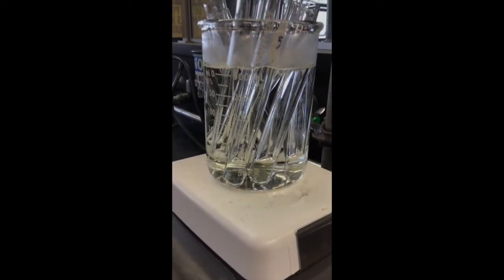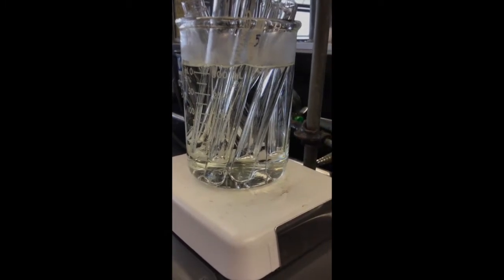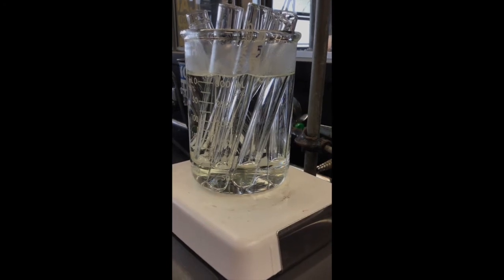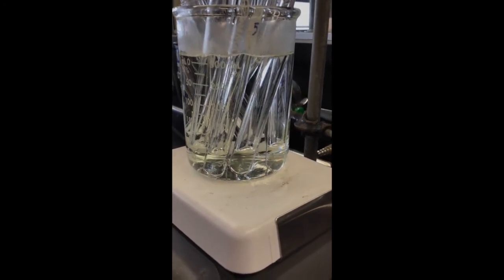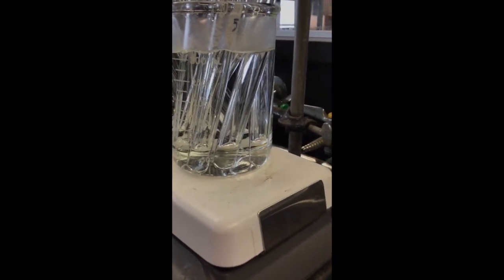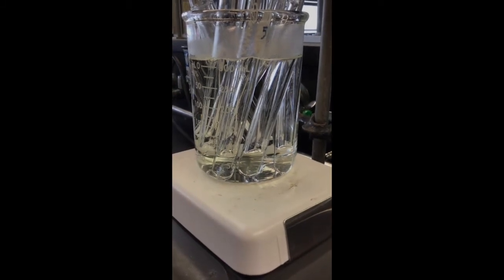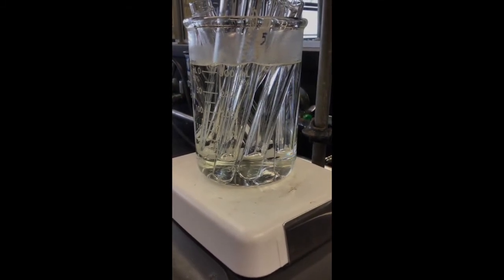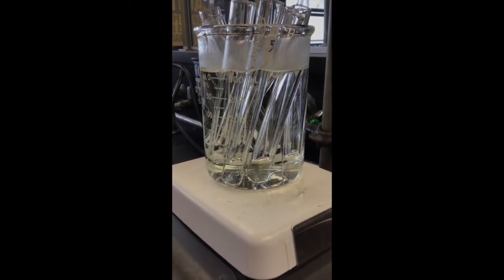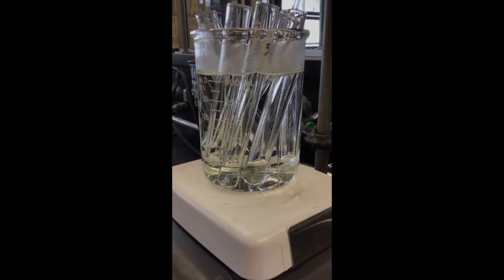Ideally we wouldn't have the tubes sitting right on the bottom of that beaker because it's sitting on the hot plate, but it's not really enclosed, not really touching it too much. And also it's only like 50 degrees, so it's not too hot, but keep that in mind. I think I misspoke in the beginning. We wanted to keep an eye on the things at room temperature after 3 minutes to see if we had a reaction.